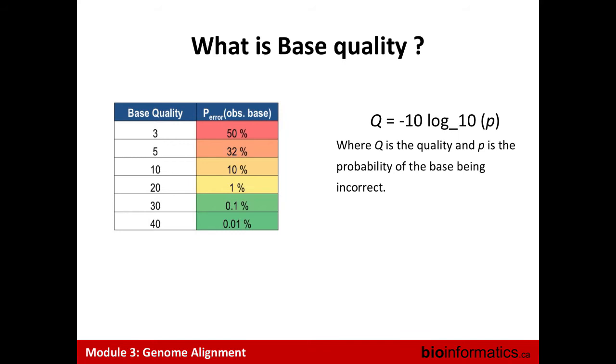So now, what's the best quality score on this chart? It depends on the sequencer. Each sequencer has its own way to measure quality and error. For Illumina, I think the top is around 40, or 50, I don't remember. But they have changed it in the latest versions. If you take the NovaSeq, they only use 4 levels of base quality. They break it into only 4 categories, so it's not a continuous value as previously.